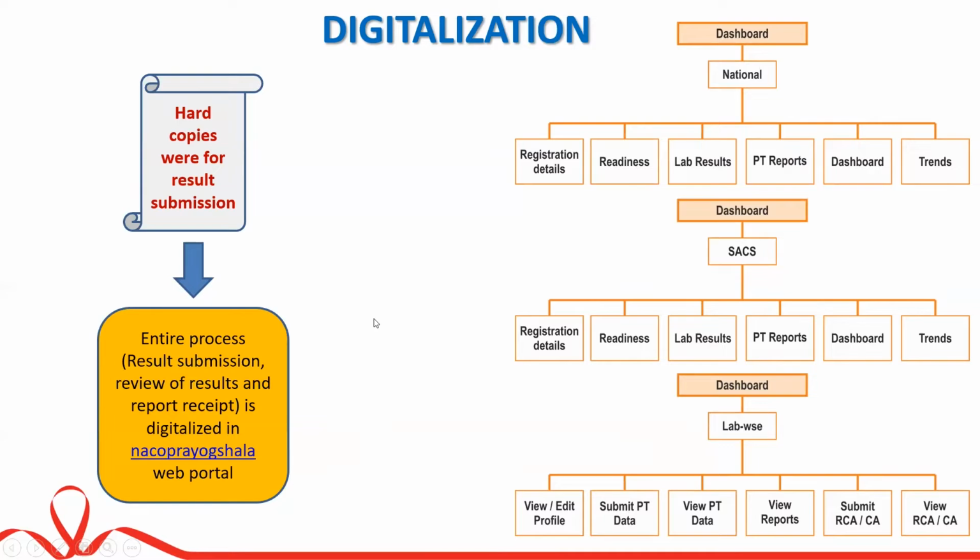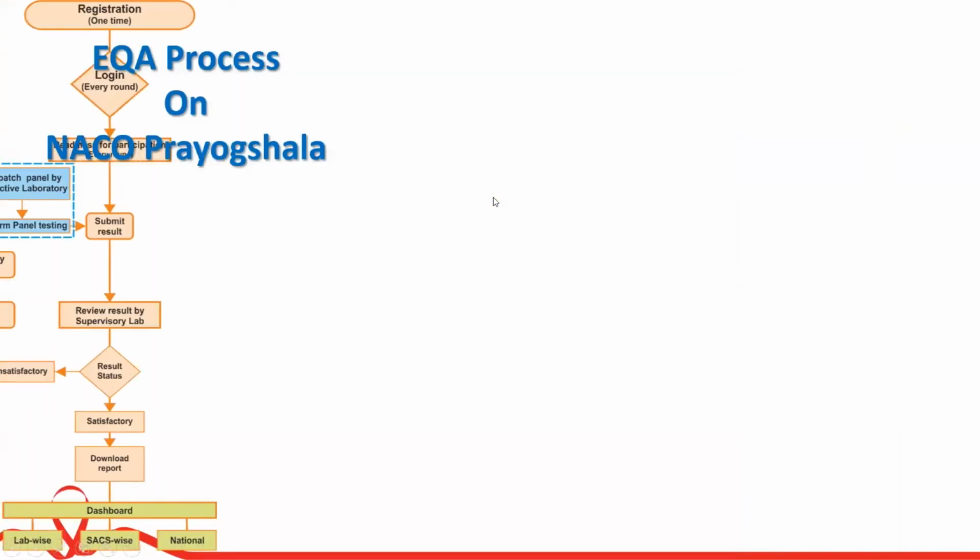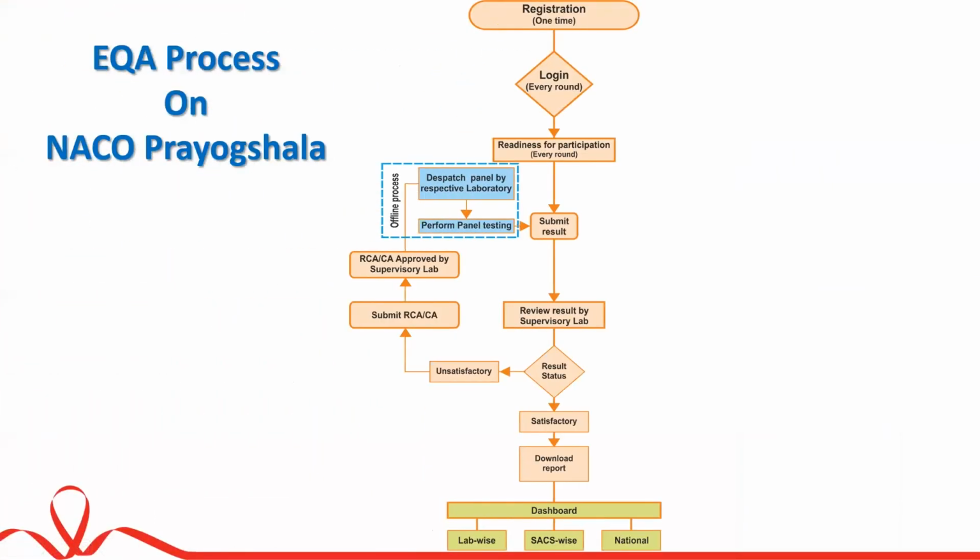Pankaj, I think if there is no technical question till the presentation, we can go ahead with the rest of the part. This is just a few more slides for the presentation. Then we are going to the live server and we can see how the system is actually working. This is again one of the flowcharts of the program for the entire process.